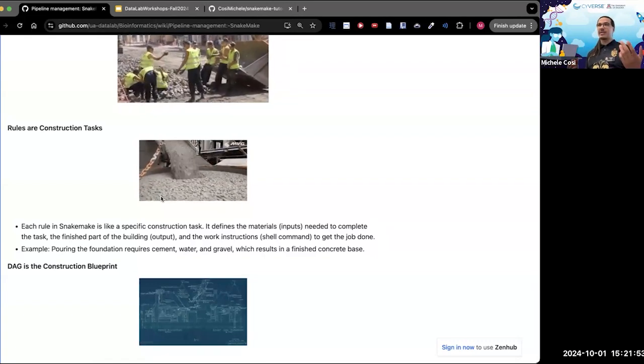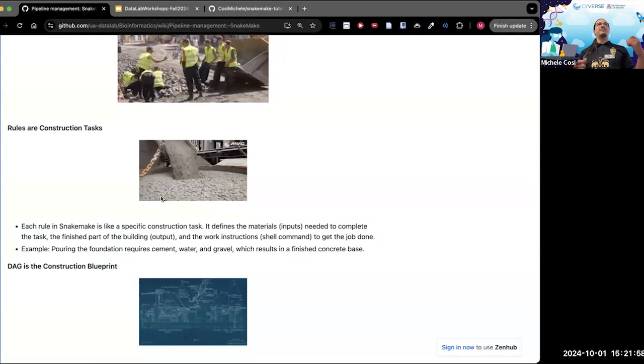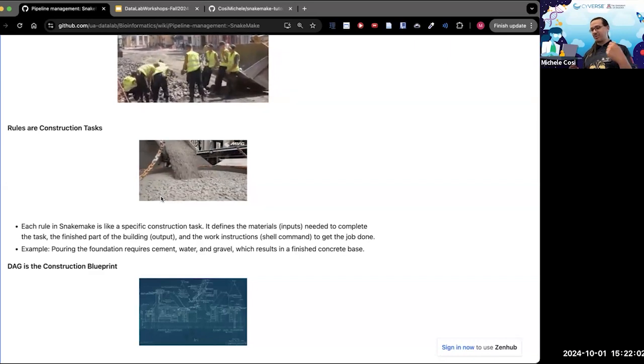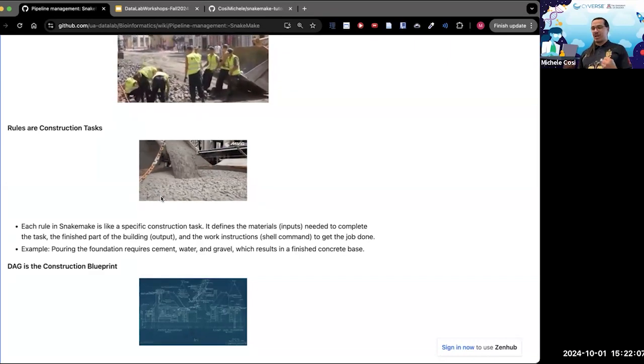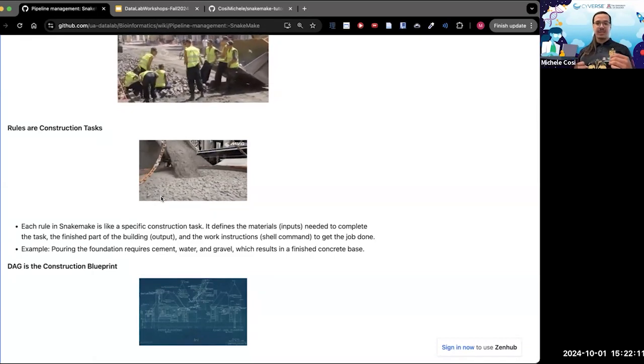in Snakemake, which is something that I like and not like at the same time, because to the point I was making earlier, what if I don't know what the output is? What am I gonna do? But this needs to be explicit, like everything in Snakemake is explicit.